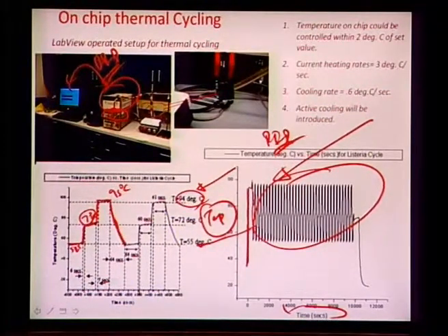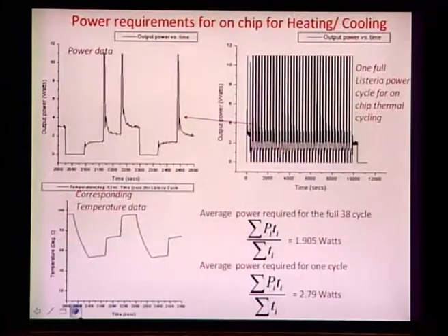downside to this is that the cooling rate is not very high, and for that there were several other modifications which were introduced, one of them being introduction of a Peltier cooler at the bottom of this particular chip, which would do forced cooling action, and this curve would go down more, although there were in that case problems related to the heating up of the particular instrument. The power requirements of the chip, this was done in a very state of the art way.